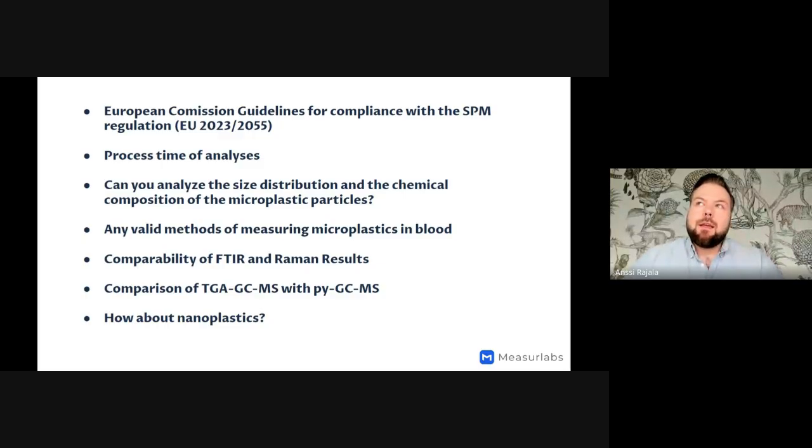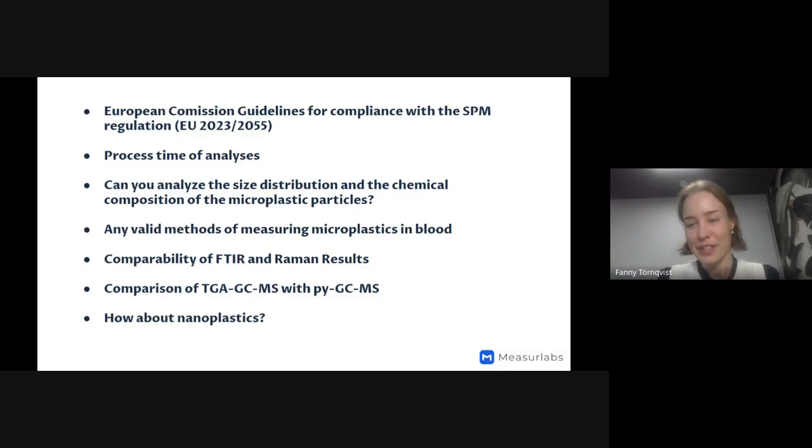But usually the common polymers that are seen in environmental samples are always included in the testing. It's basically impossible to answer which should be included, so it depends on the judgment and the assumption of what would be most interesting to study. Yes.